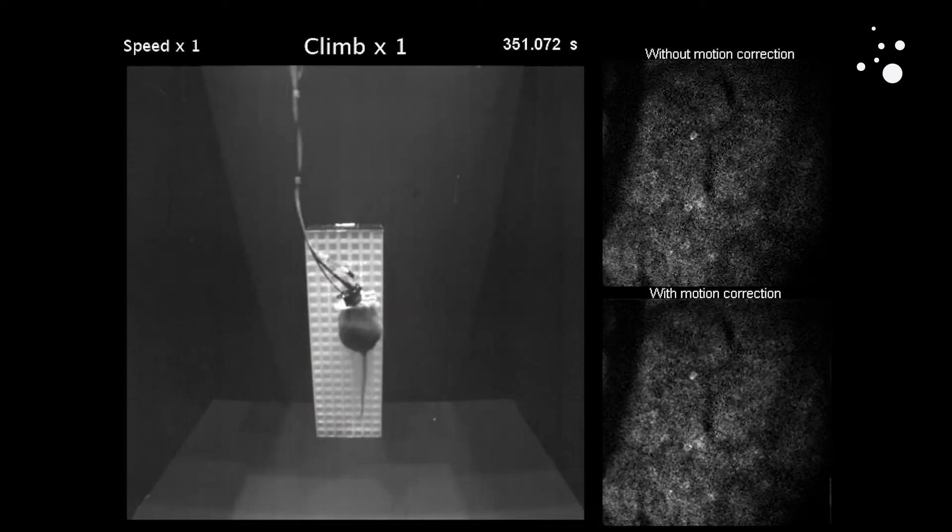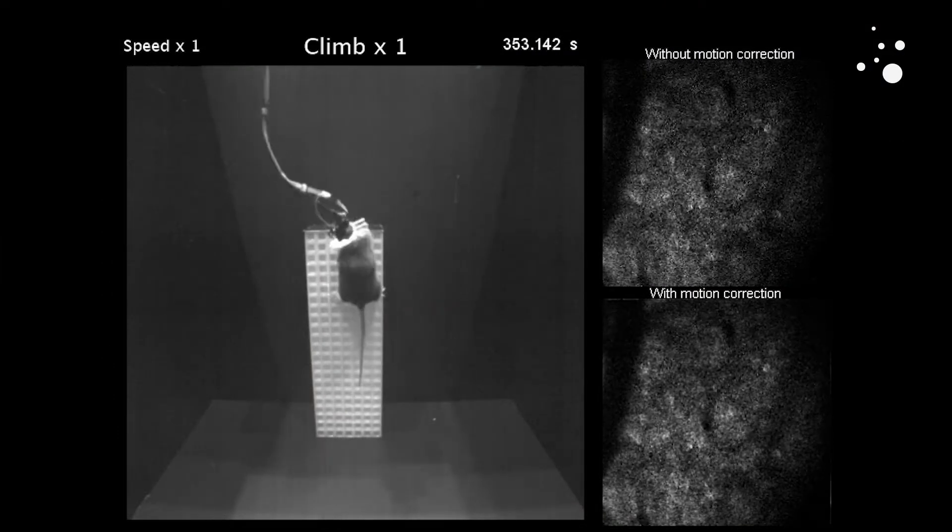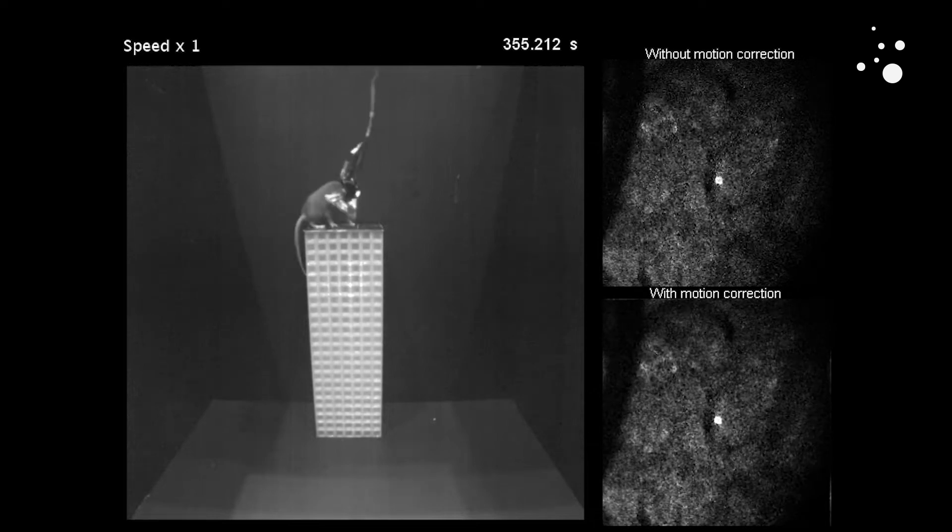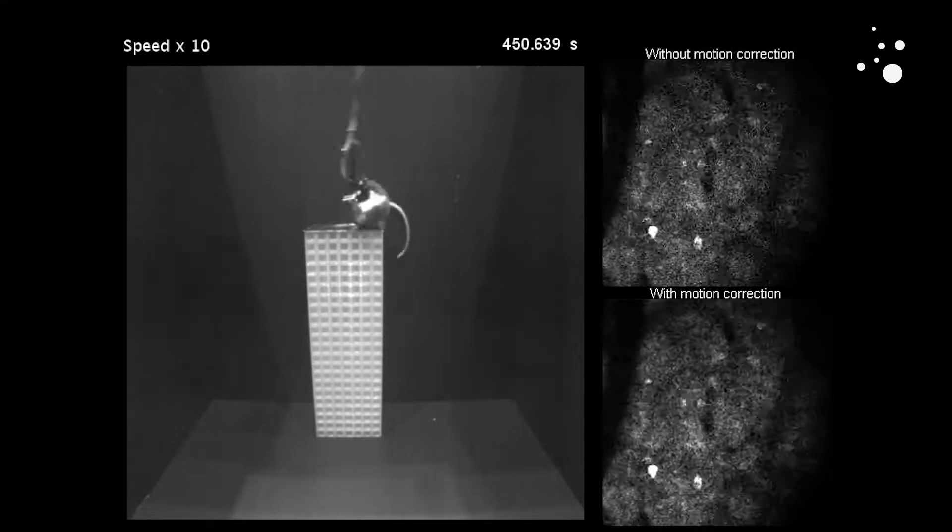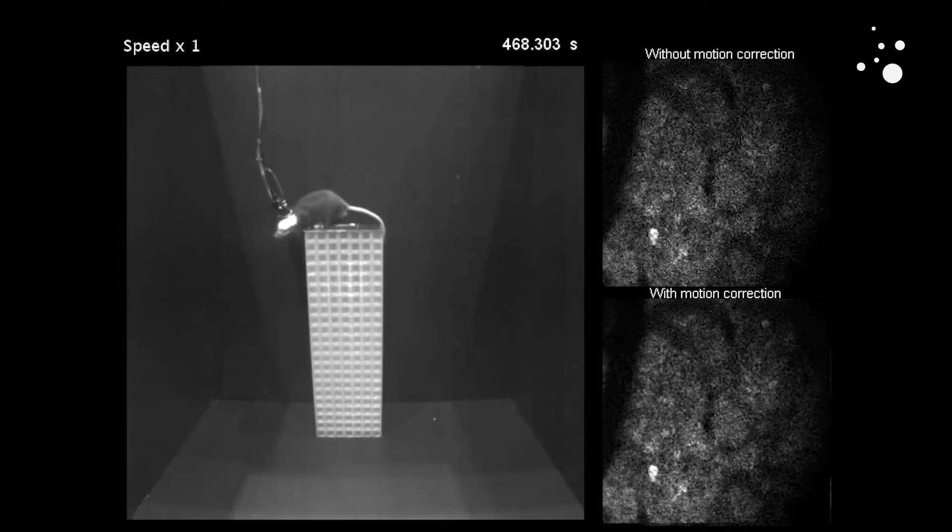Mini2P can follow the mouse no matter what it does. That means it has to be extremely stable. Mini2P can follow the same brain cells with precision for more than a month. And it keeps these cells in focus even when the mouse is very active.